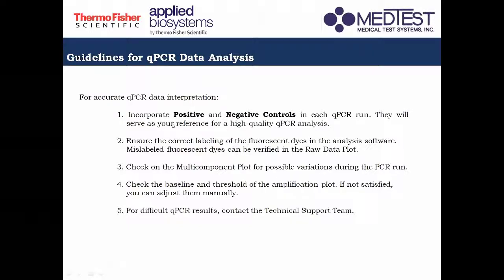questions. But in summary, no, for you to have a good qPCR result, no, you have to have positive and negative controls. This is really important kasi this would tell you kung maganda ba yung run ng qPCR nyo o hindi. If the result of your positive control is not good, then this would serve you a reference na there is something wrong in your qPCR run.